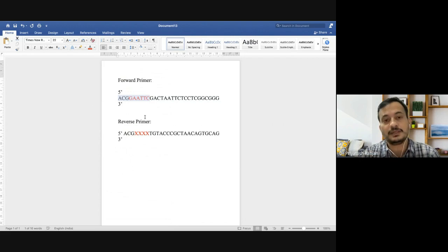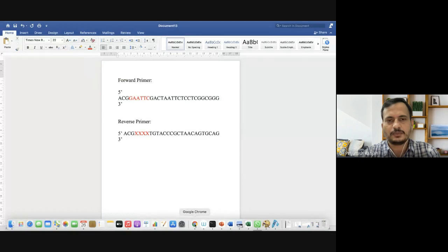And also remember, since in the initial few cycles these sequences are not going to bind to your gene of interest, you should not be bothering too much about the GC content and the annealing temperature, which should be coming from this region. That was the reason we calculated those stats only from these sequences. If you want, you can calculate from the entire sequences, but that is not going to affect the scenario much.